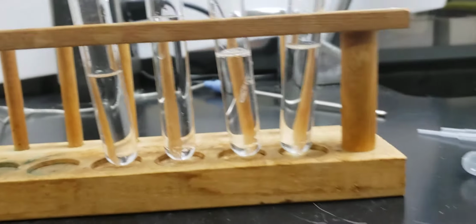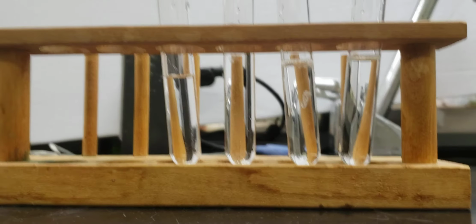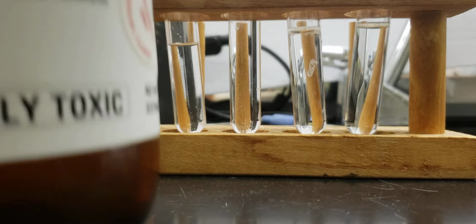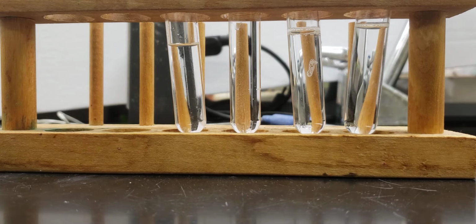Now we'll add in our solution. We're going to start by adding in some silver nitrate. Whenever you work with silver nitrate, you're going to want to use gloves because it has the propensity to stain hands. The silver ion is only able to be soluble when it is with nitrate.